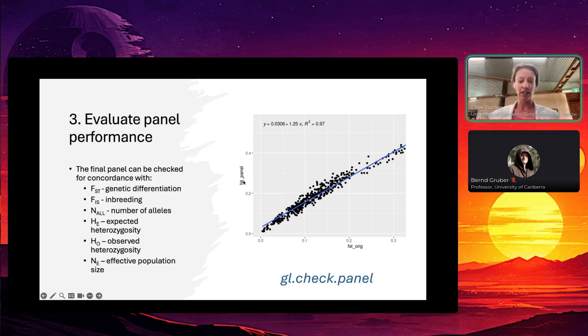So previously our FST was only reaching up just over 0.3. With this new measure now, we've got FSTs getting up as high as 0.4 and slightly higher. So the relationship stays the same, but the absolute values differ, and we can see that this new panel can actually give us some increased resolution in differentiating between some of those FST values between populations.